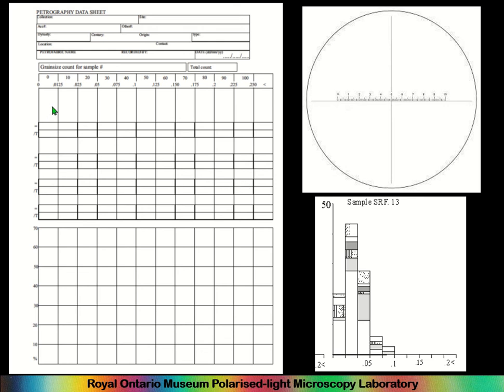And then what you need to do is total them up and divide, recalculate it basically until it makes up 100, because you want it to make 100%, not 150 divided by whatever. So you need to recalculate these numbers, these 150 grains, or about 150 grains, down to 100. And then you plot it on here.